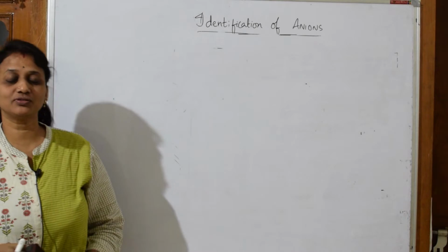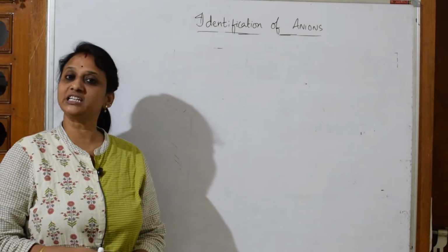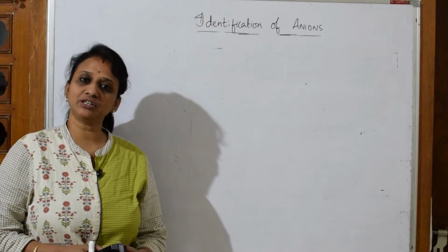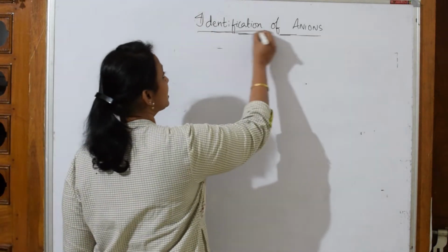Right, welcome back students to one more session of your salt analysis. That is, we have started with the qualitative analysis of your grade 11 and grade 12 chemistry. Now in salt analysis, I've already taught you, let me recollect what I've taught you.